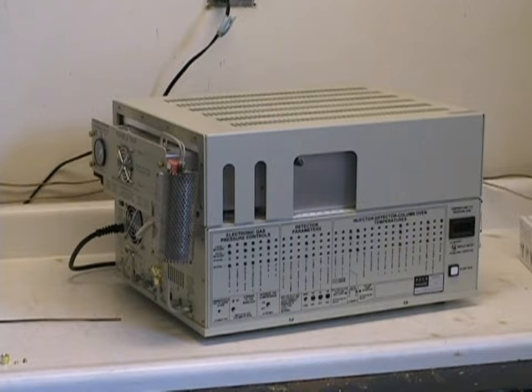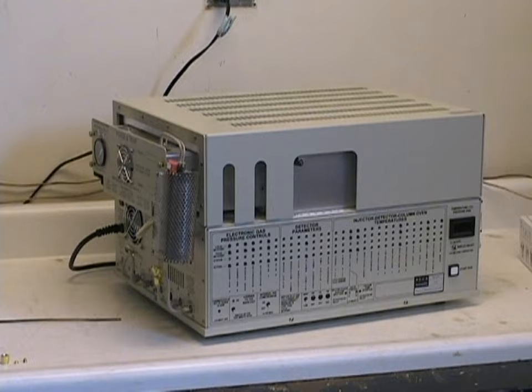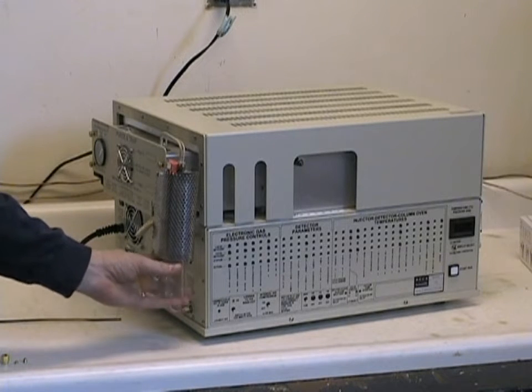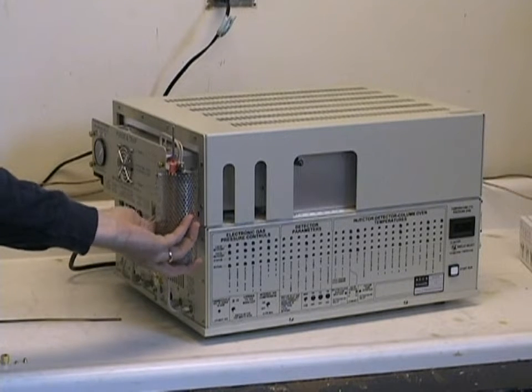This is the Buck Scientific series 910 gas chromatograph configured with the heated static headspace sampler, where your VOA vial containing your sample will go into the holder, and then you will have an automated sample preparation.